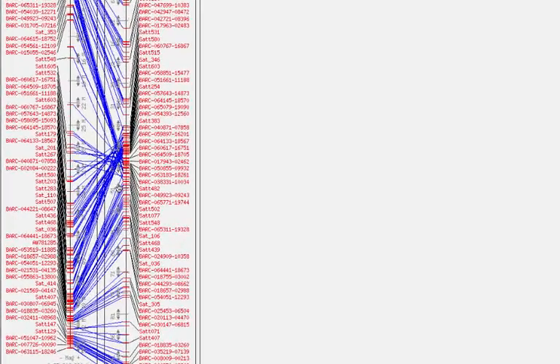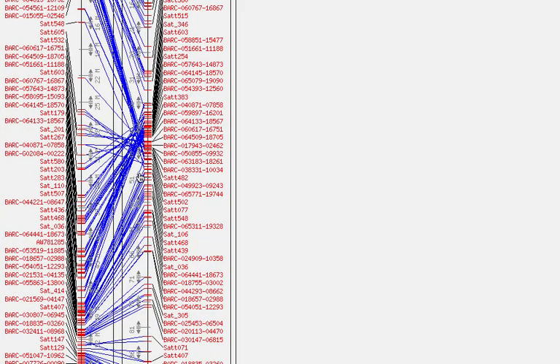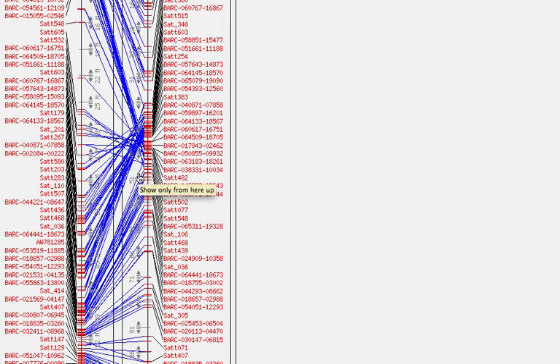We can get a little better picture of this by zooming in. We do this by simply hovering over the centimorgan markers and the up arrow, which will allow us to cut off the bottom half of this map.